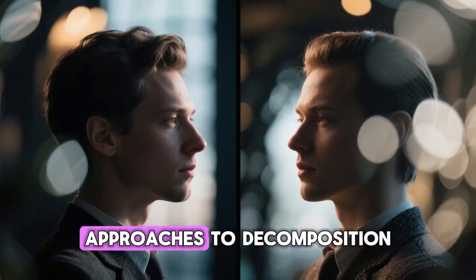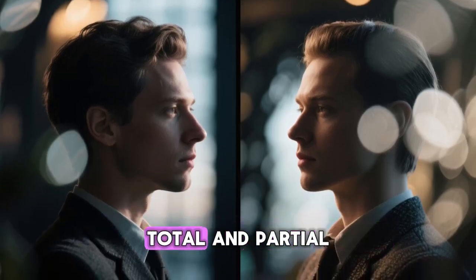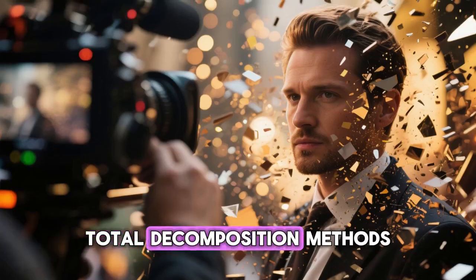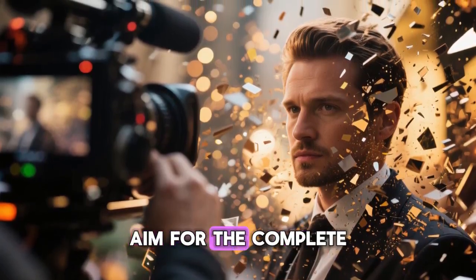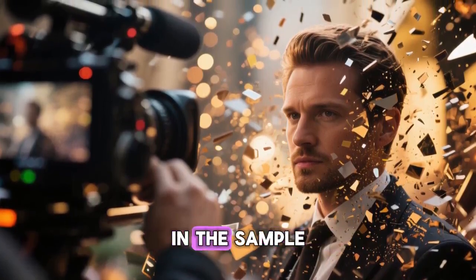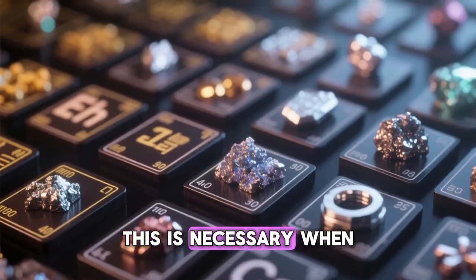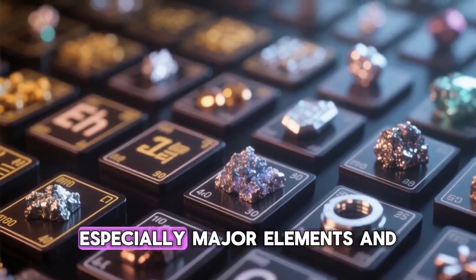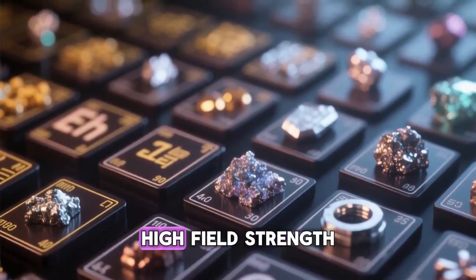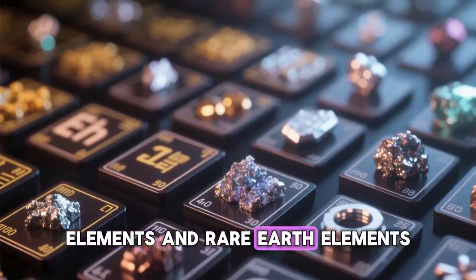There are two main approaches to decomposition: total and partial. Total decomposition methods, also known as a strong attack, aim for the complete dissolution of everything in the sample. This is necessary when we need to know the absolute abundance of elements, especially major elements and things like high field strength elements and rare earth elements.